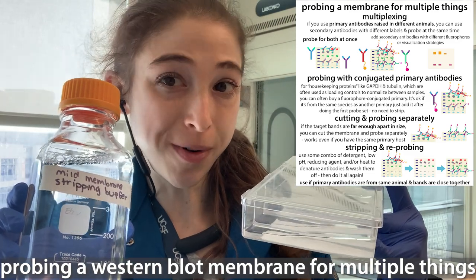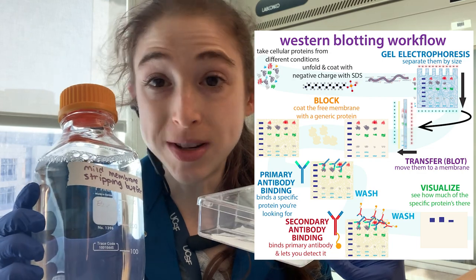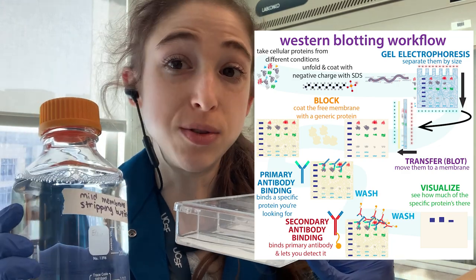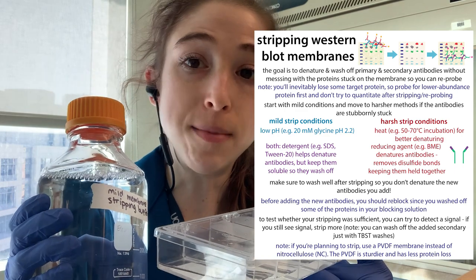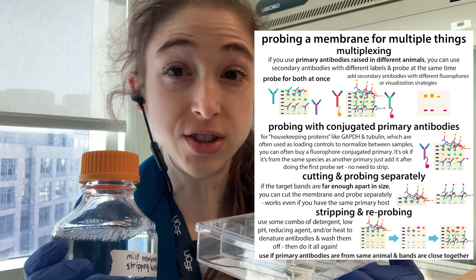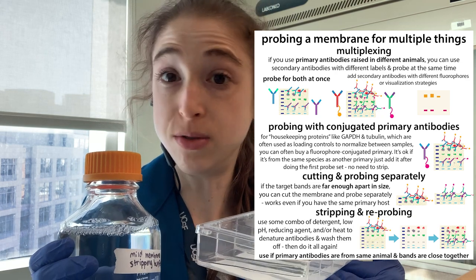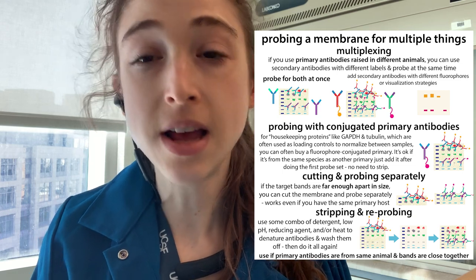Let me see if I can strip away confusion about probing a Western blot for multiple proteins. So a Western blot is a technique that we can use to detect various proteins, and sometimes we want to detect multiple proteins. There are various ways to do that, including stripping and reprobing, as well as cutting into smaller pieces and probing separately, using conjugated primary antibodies, and multiplexing, where you just do them at the same time if you have compatible probes.